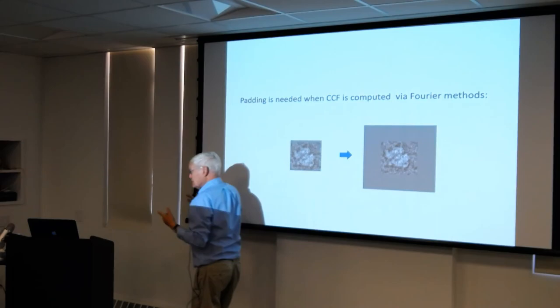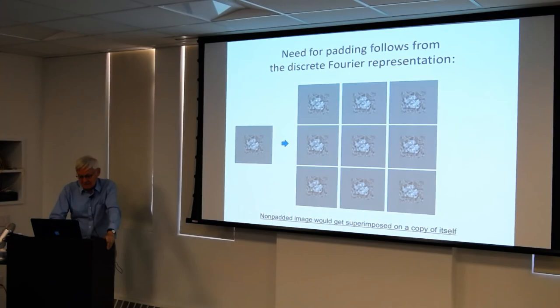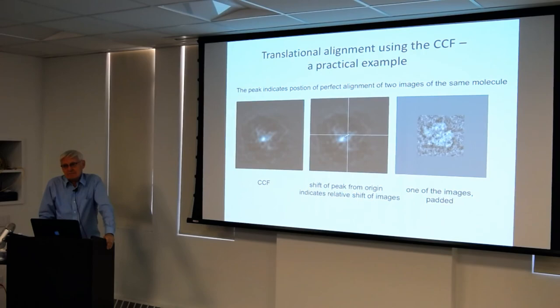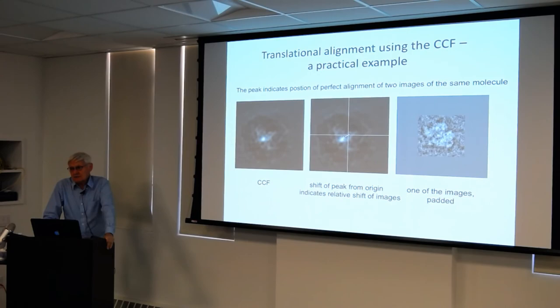You will see this kind of padding everywhere, right? And this is just an example for a cross-correlation function. So I think I should just honor your normal lecture time. There are a number of things that I go into, including the 3D reconstruction and classification, and I hope you can get the information from the rest of the lecture.